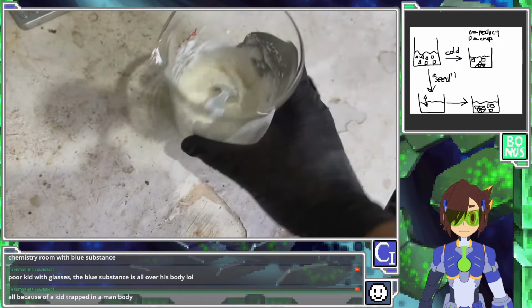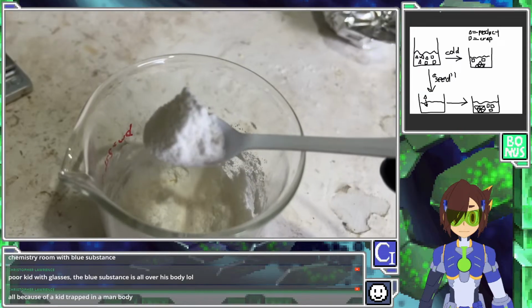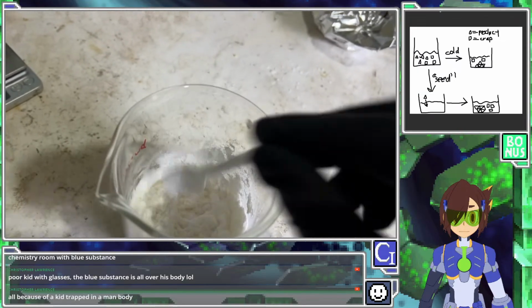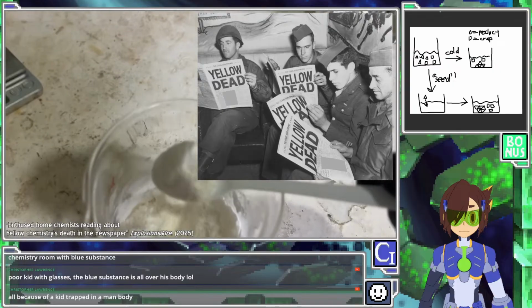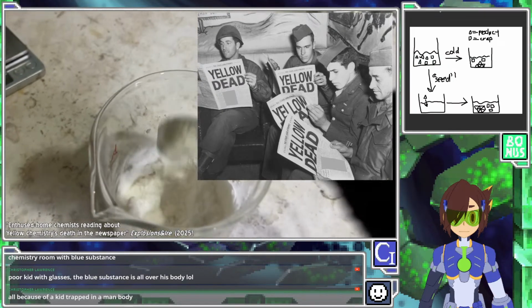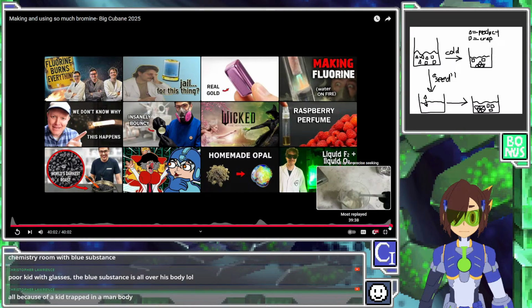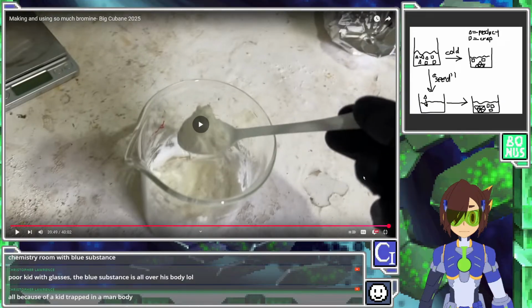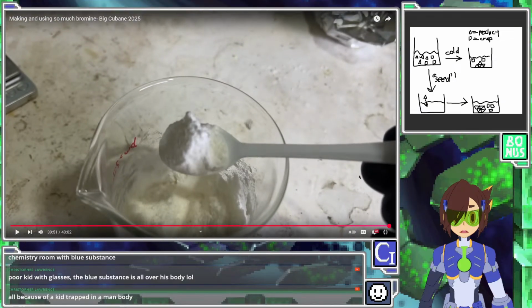With 170.8 grams of this dense powder that has an off-putting smell of sickly, moldy carpet, but not a trace of the color yellow in here. This is fantastic. Not even a recrystallization needed. It looks perfect. Oh, well, that's that very abrupt end of the video, but yeah, that is probably one of the best products he has ever made. I'm trying to get a good still frame of it.